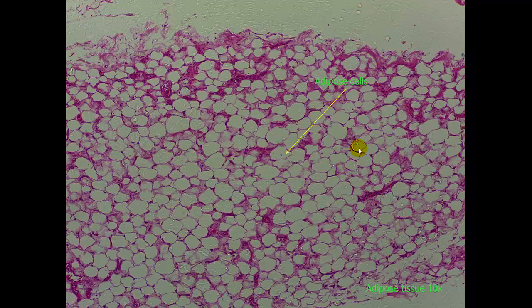The first slide is a view of adipose tissue. We can see the type of tissue listed here and the objective magnification. This is not the total magnification. If you want the total magnification, you take that number times 10. This slide is showing the adipose cells. One thing to keep in mind is your slide may not look as good. As they are fixing the slide, sometimes because these cells are so fragile they will tear and you will only see parts of the cell membranes. So keep that in mind. You may actually be looking at adipose tissue even if it doesn't look as neat as this slide.